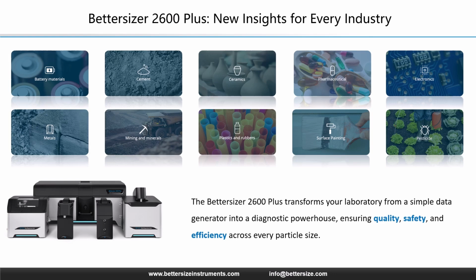In mining, we move from data silos to total process control. The sieve fusion function unites the mine and the mill into one efficient workflow. In ceramics, we move from standard QC to ensuring durability. Our high resolution detects the coarse tail that causes structural cracks. This is the power of the Bettersizer 2600 Plus. It transforms your laboratory from a data generator into a diagnostic powerhouse.